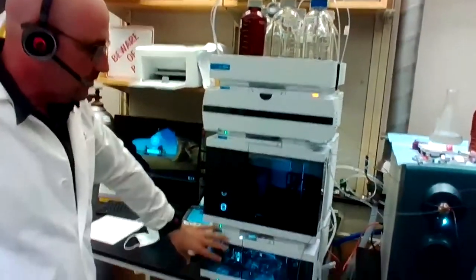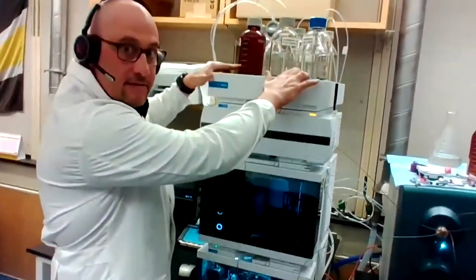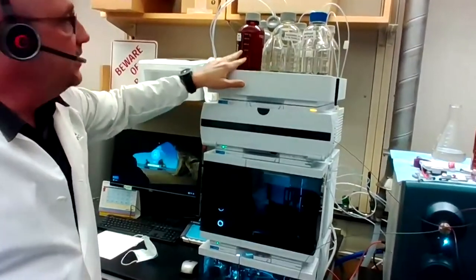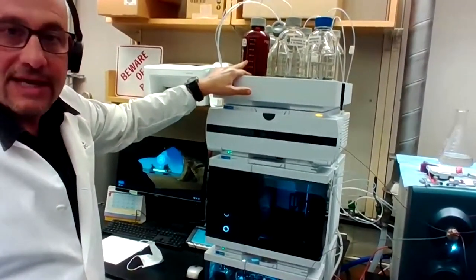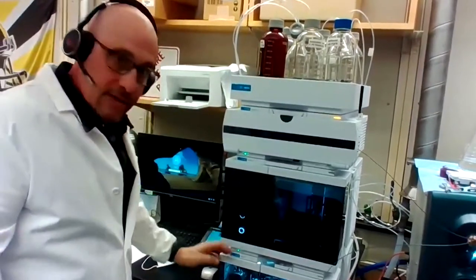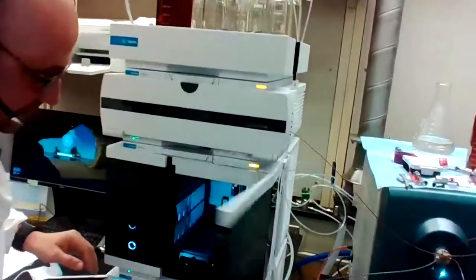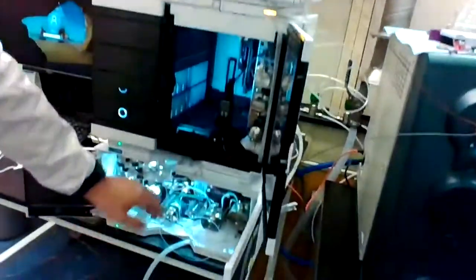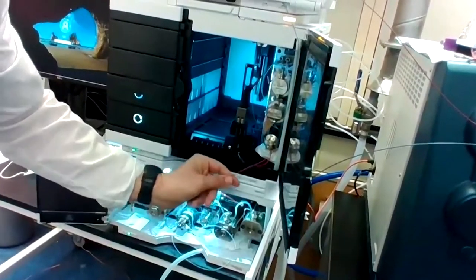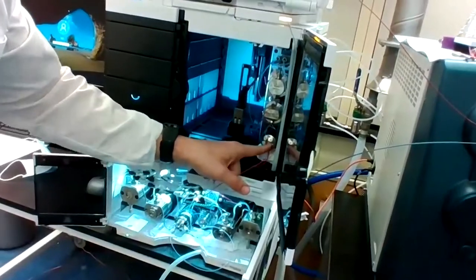The way it works is the pump on the bottom pumps mobile phase, which is located on top. Today we'll be using acetonitrile and water that has formic acid, which helps ionize the compound. It's drawn into the pump and then comes out, with the mobile phase flowing through here at a flow rate of 0.4 mils per minute into the auto sampler.